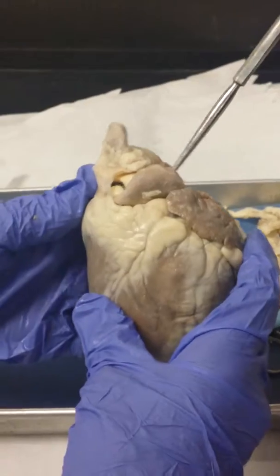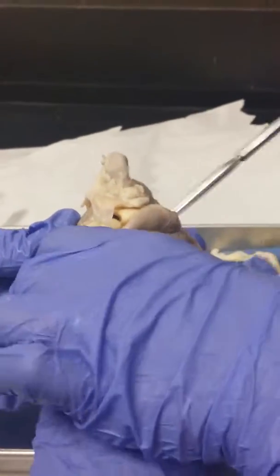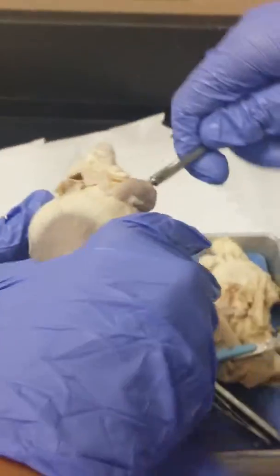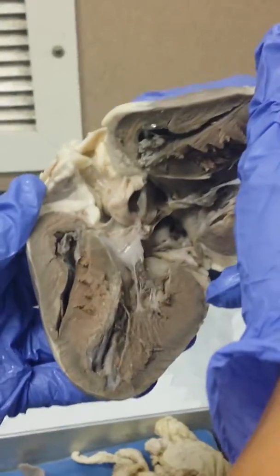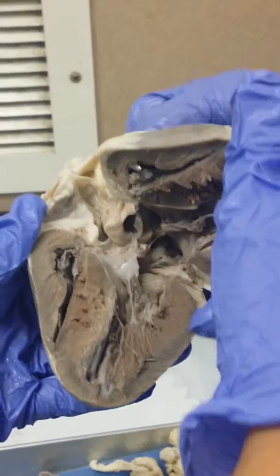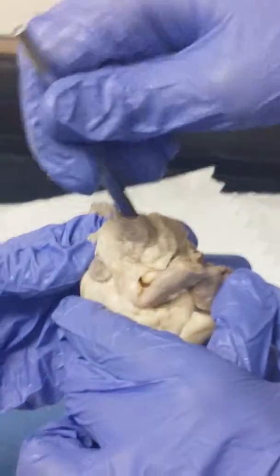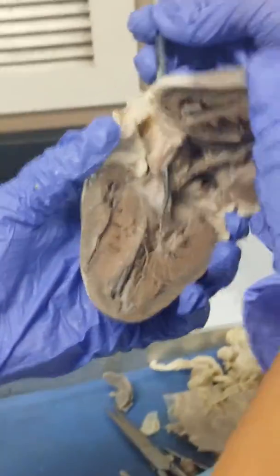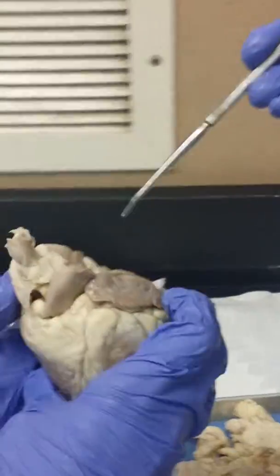If we go up to the great vessels and put the probe in this one — it came out the right side — so that's your pulmonary artery. And if we go on this side and stick it in that one, that is your aorta.